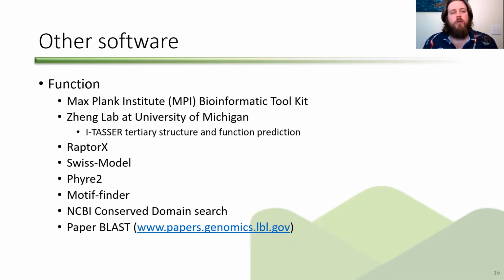If you want to resolve those, here's a list of software to get an idea about what those things could do. It's not guaranteed that you're going to be able to pull out a function, but it is possible to maybe get a better idea. Maybe look for domains. For example, you may find some hypothetical proteins that have a DNA binding domain that may give you an idea about what it does. And I'm going to have all of this software up at the end when I talk about some questions I had from the last time I gave a seminar like this.